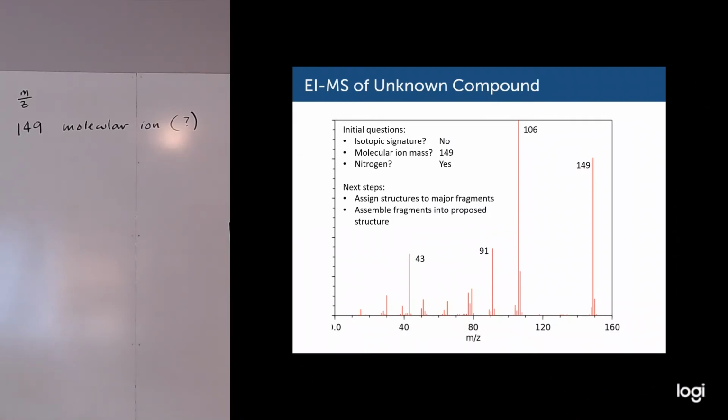Okay, so we're going to split screen here. You can see on the right the mass spectrum of the unknown compound along with labeled peaks for some of the more prevalent ions. And so we've talked a little bit already about what might be true about the structure.